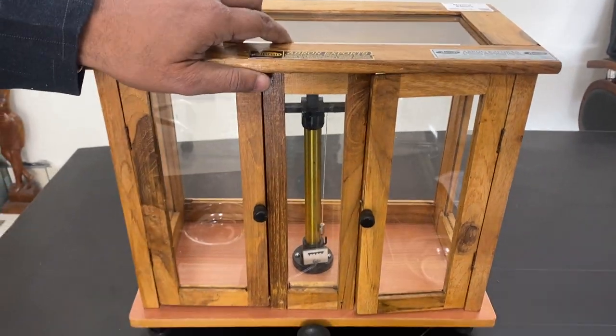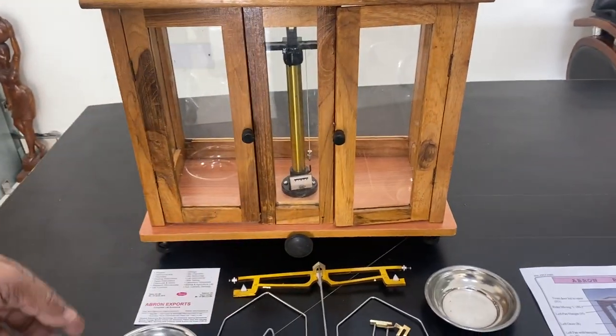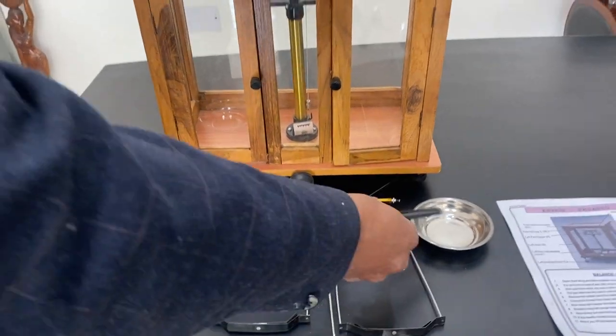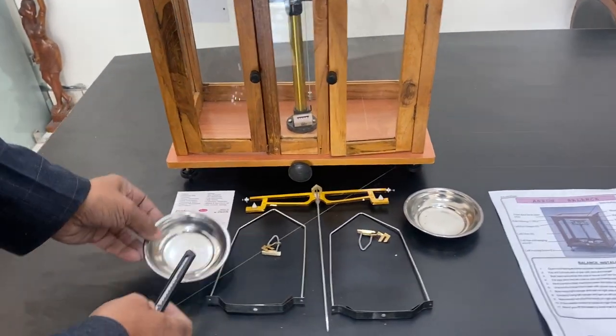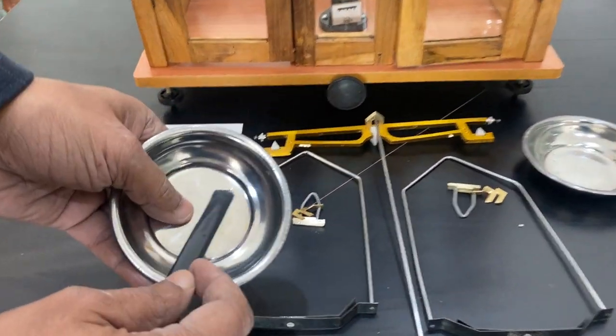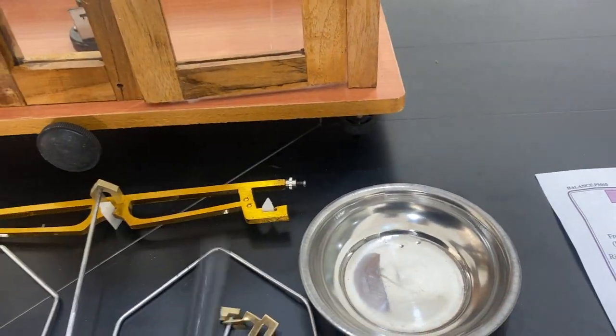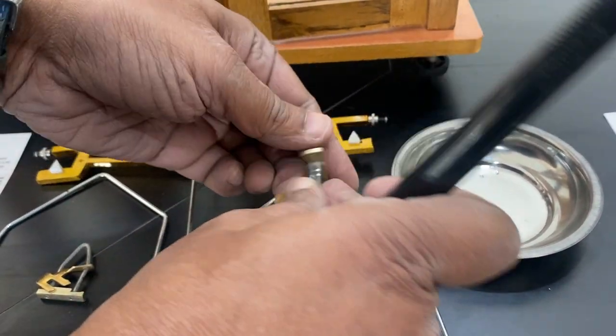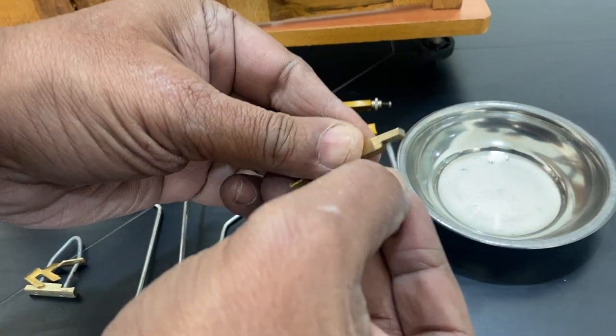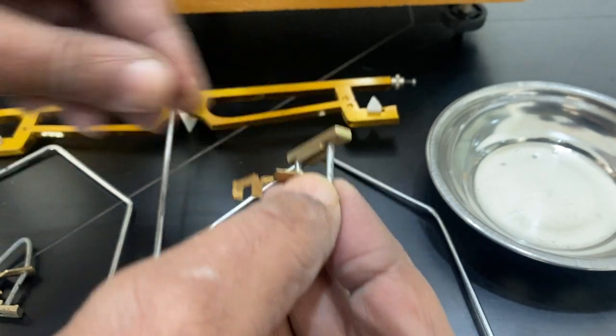First, you need to see what the parts are. When you open the box, everything comes with the packing. There is a single dot knob here, and there are two dots on this and two lines on this. You can see the two lines here.